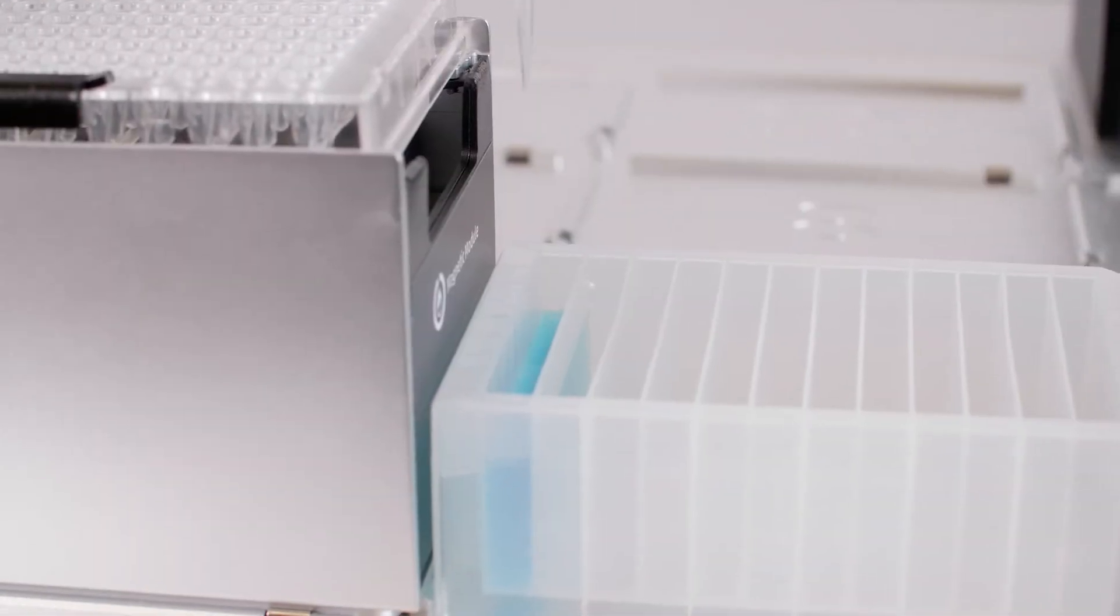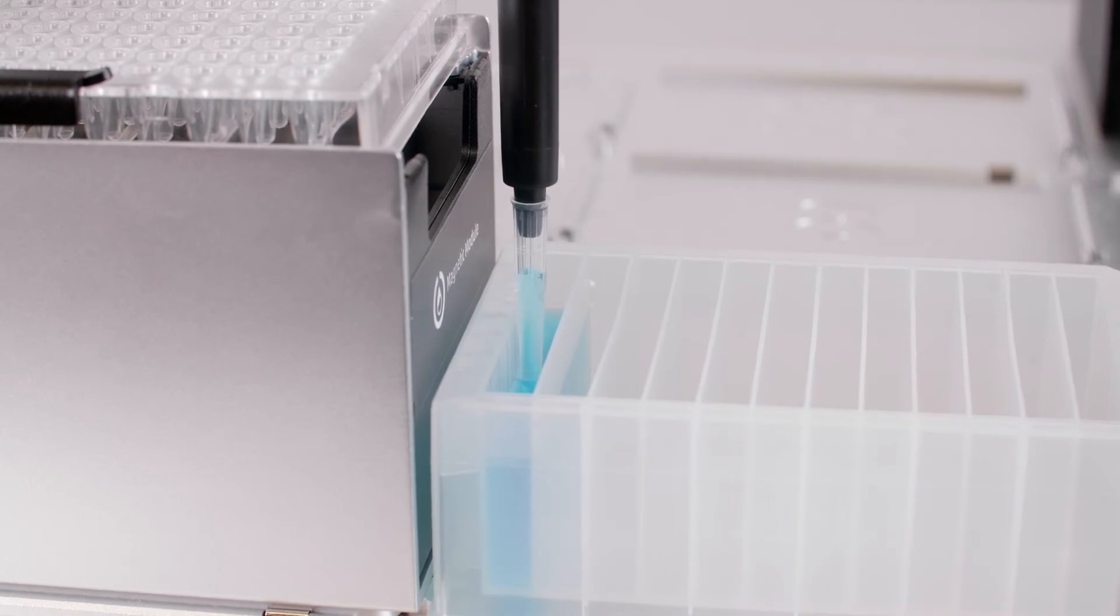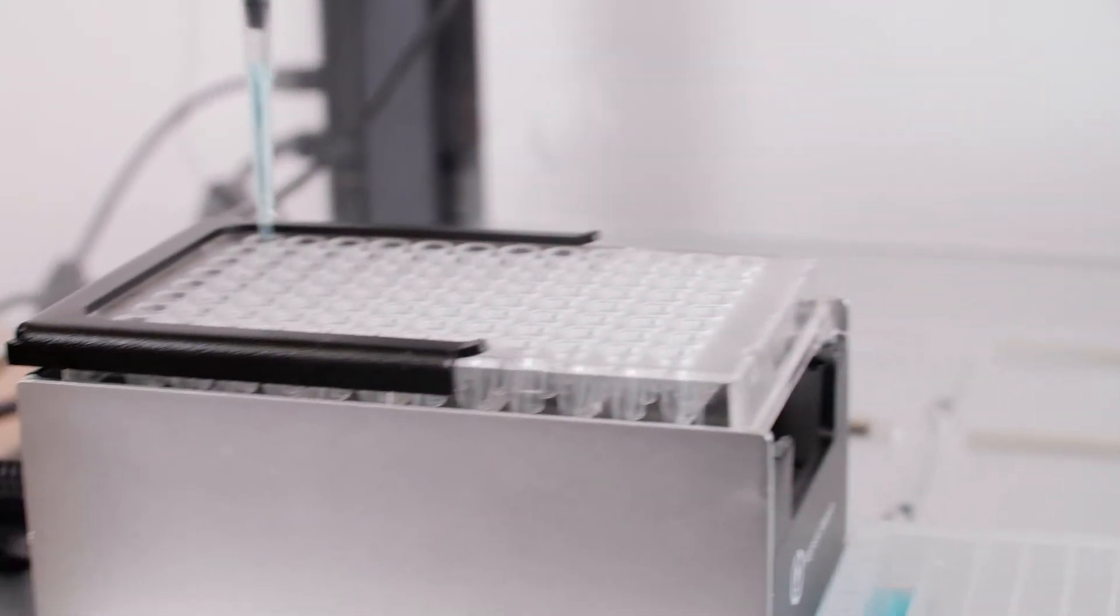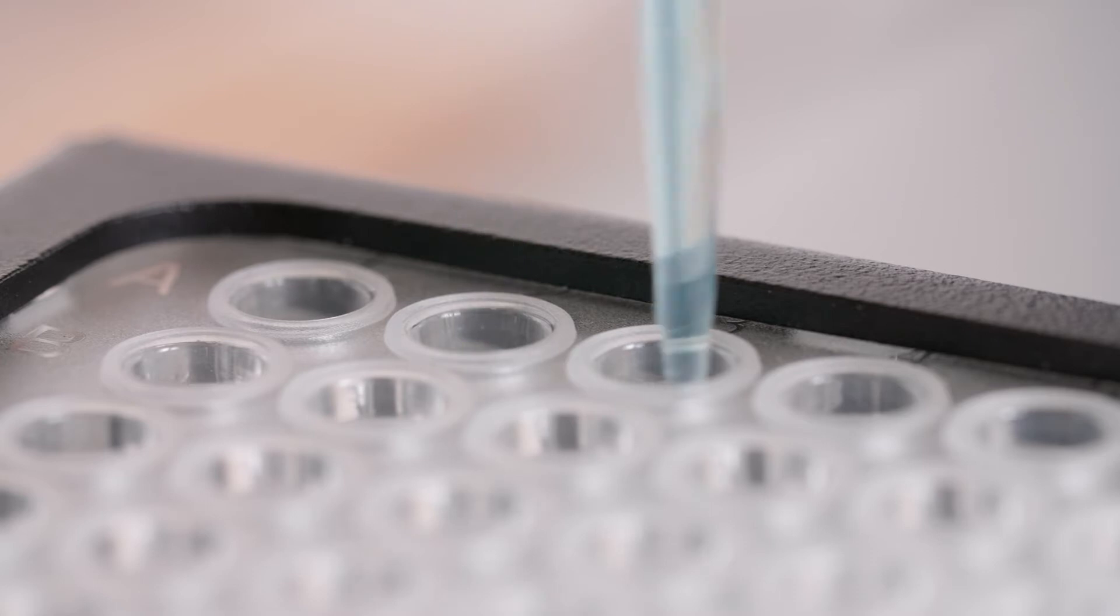The module fits on the OT2 liquid handling robot, which means you can also automate your mag bead-based purifications within more complex workflows like microbial cloning or NGS library prep.